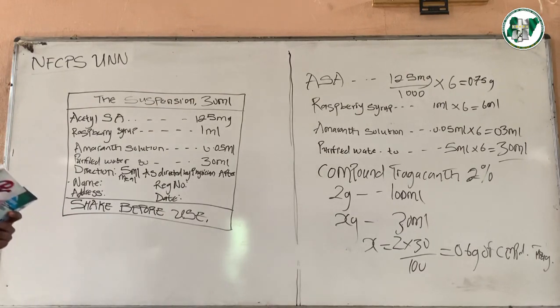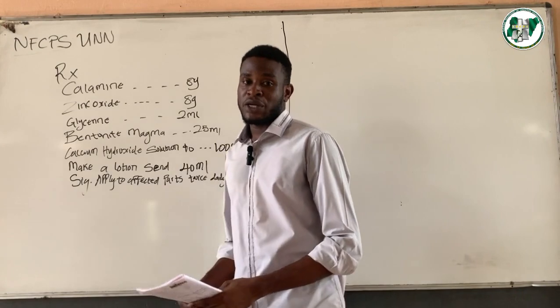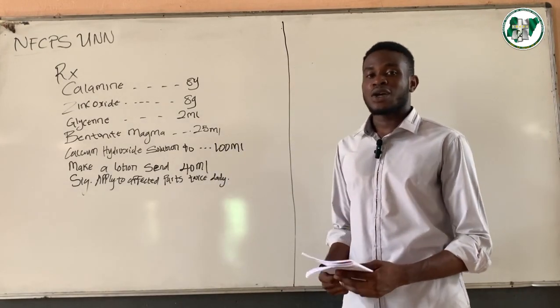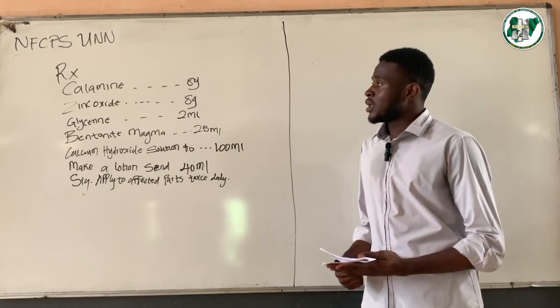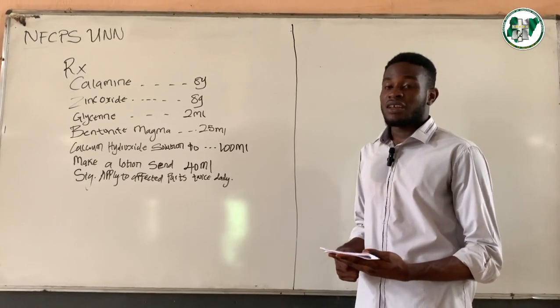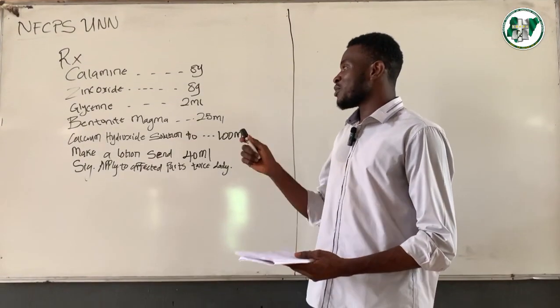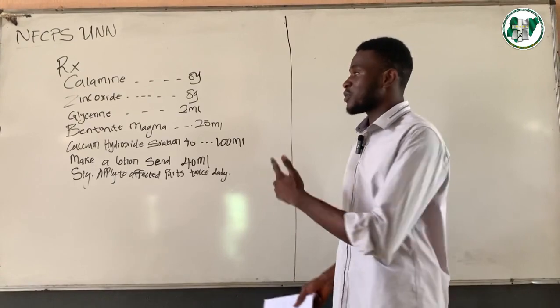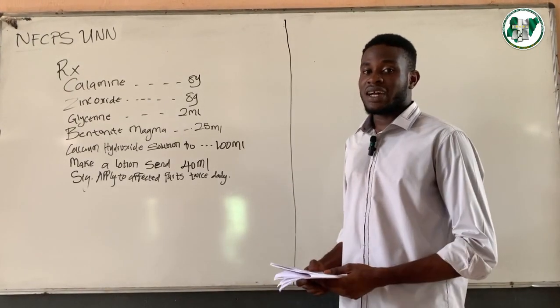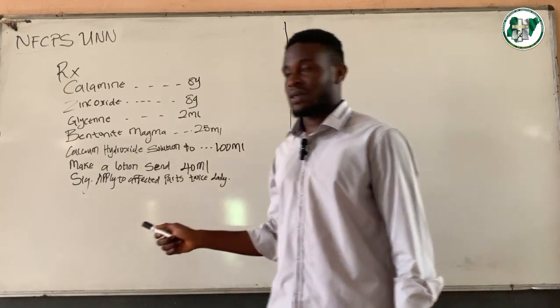The next question we have here, we are going to be talking about calamine lotion. Okay, to the next question. Remember, we've been talking about liquid preparations, but the two liquid preparations that we considered were for internal use. Now, we're preparing a calamine lotion. The difference between that and this is that this preparation is for external use only, and you don't need to use a suspending agent for this.